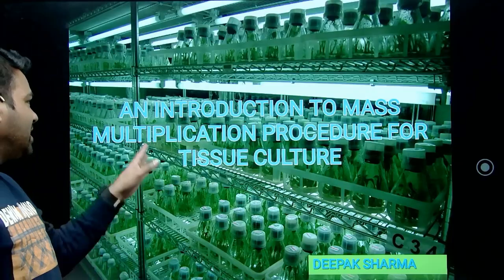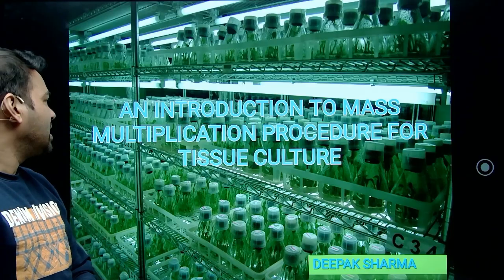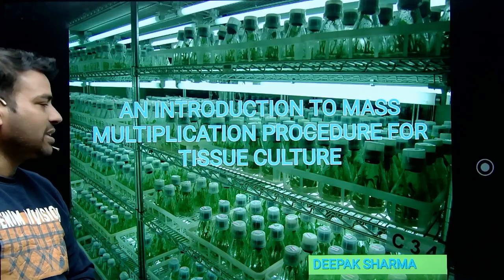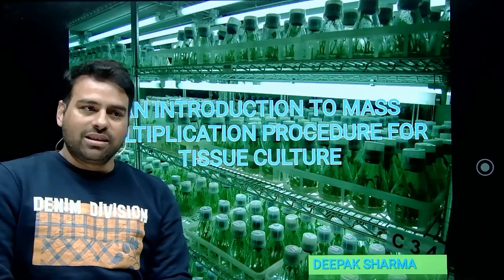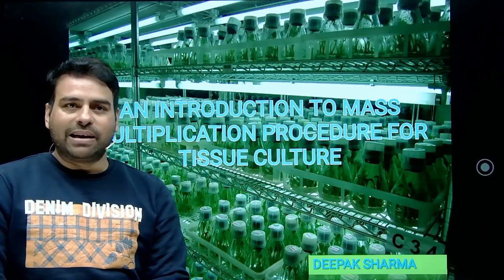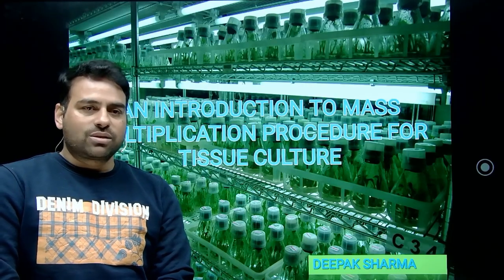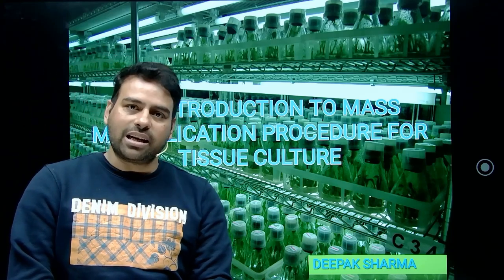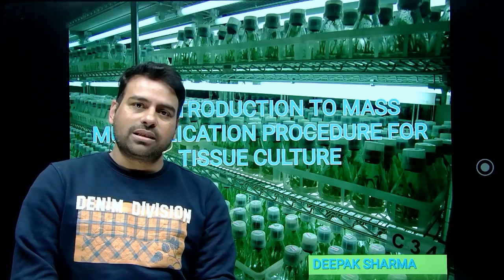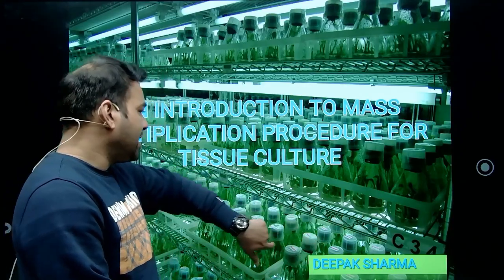So today we will discuss a topic: an introduction to mass multiplication procedure for tissue culture. Basically, tissue culture is a very common term in biotechnology and life sciences. Nowadays, it is very famous to multiply plants according to the need, according to their space. So here we are starting it.